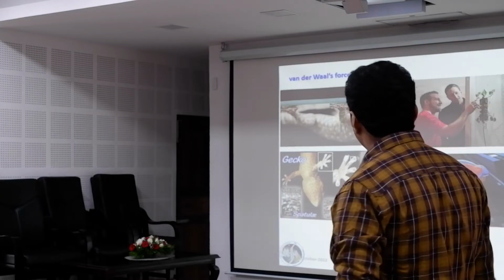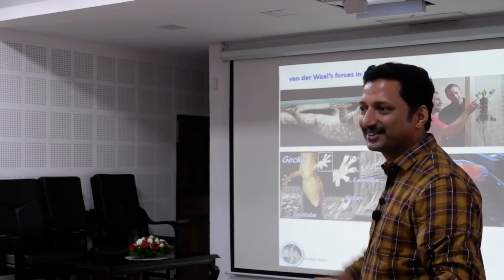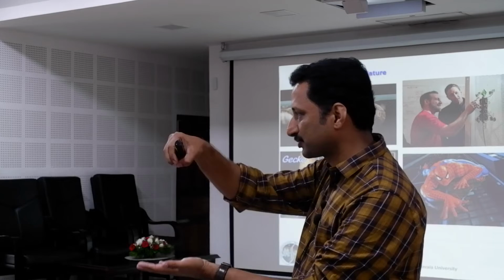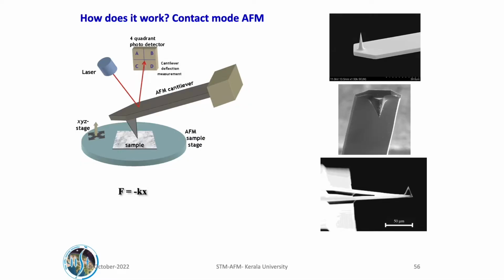This is the basics of AFM, and this is the problem with the contact mode. We cannot tear the tip like this in the AFM. So snap into contact means you need a large force to release the tip. So this is how the tip is.